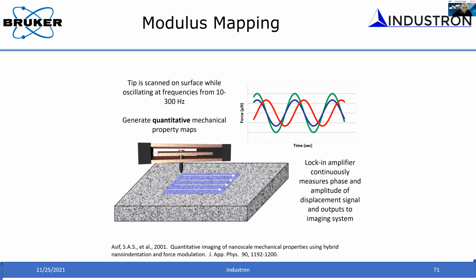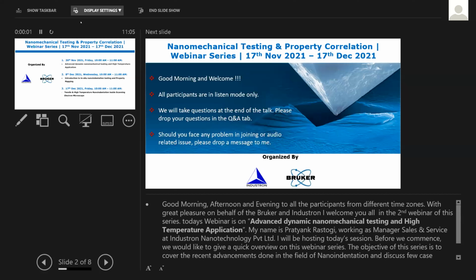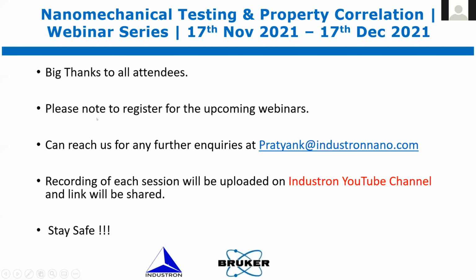The average modulus obtained from nanoindentation of a two-phase material will also have a high standard deviation. How can we compare with UTM? Well, that gives you the role of the microstructure. I don't know exactly how to compare with UTM, but it gives you clarity on the UTM measurement that you did, the contribution of these phases in terms of statistical distribution. Maybe you need to develop a model to compare with the UTM measurement, but nanoindentation gives you the data to do that.